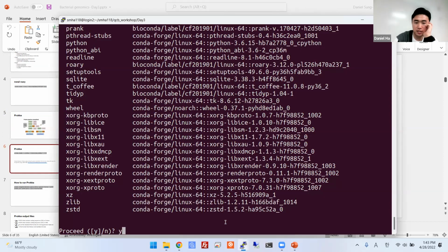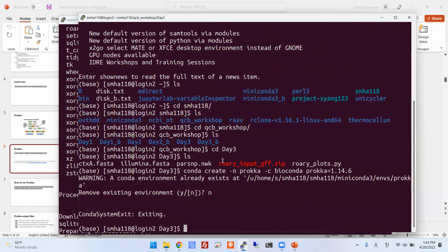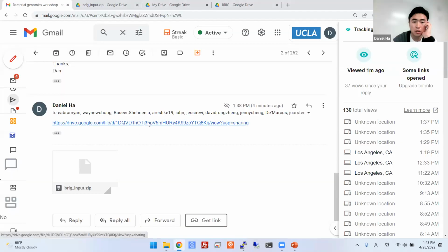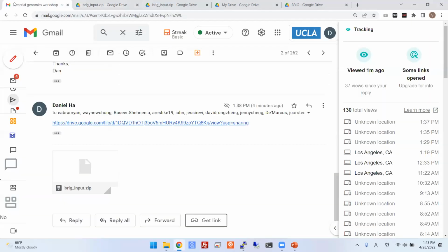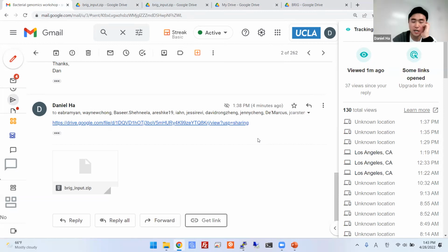Don't forget to hit yes. I'm trying to download the one on the first download data slide that you said to download to your local computer, but when I click on that drive link, it says that the file is in the owner's trash and it won't let me download it. Really? The link I sent you through the email? Oh, I will use that one. Yeah, sorry, thanks.